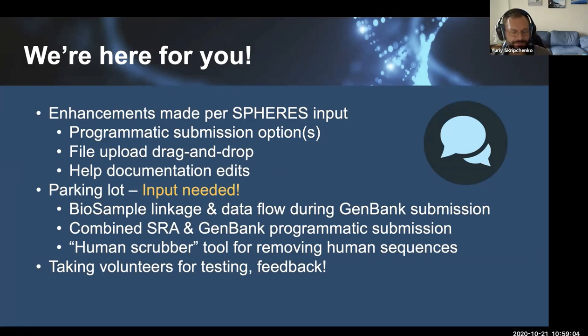So the last slide is, we're here for you. We've done lots of things with your input that have made very good improvements to our system, such as the programmatic submission options, the file upload, drag and drop for the system. We've had multiple documentation edits thanks to the feedback we've received from the SPHERES group. But we do still need feedback from you guys to continue improving our services. We certainly have some BioSample linkages and data flow discussions for GenBank submissions. We've briefly talked about how to do programmatic submissions for SRA and GenBank at the same time.